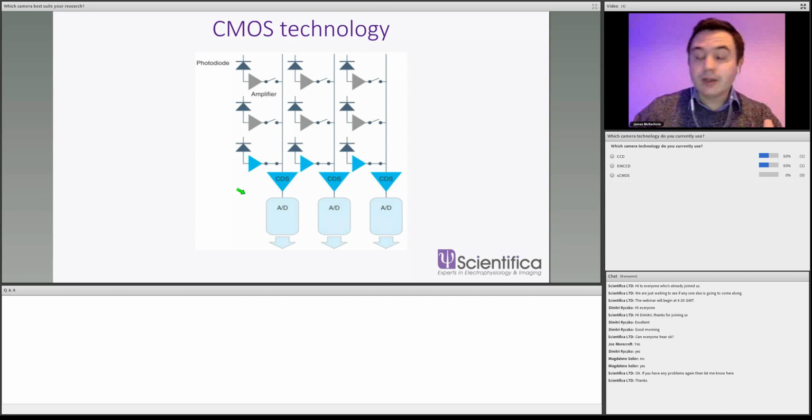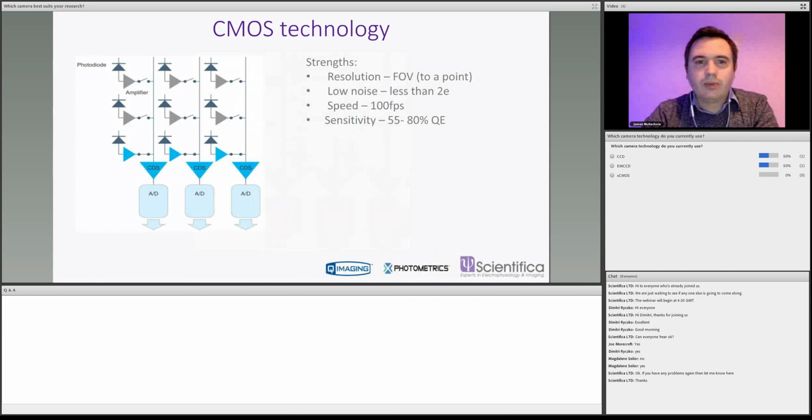Now, what we're actually doing here is taking each measurement on the pixel side, and then you can see here we're closing the gate to get that down to the ADC. We do that in rows. Here the bottom row is exposing, but you'll read off the top row, then the next row, then the next row, and so on and so forth down. You don't have the area to store charge like we're doing on a CCD. Why is that important? Well, that can cause some problems, and we'll come on to those in a short second.